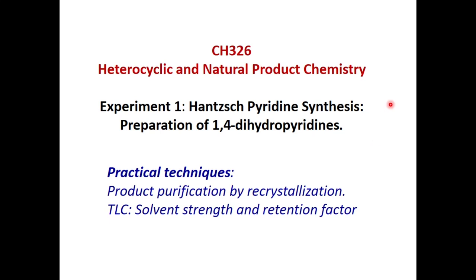Hello everybody, and today we have experiment 1 for the CH326 labs. It's the Hantzsch pyridine synthesis, the preparation of 1,4-dihydropyridines. And we'll be dealing with some practical techniques, product purification by recrystallization, and TLC, where we look at solvent strength and retention factors.